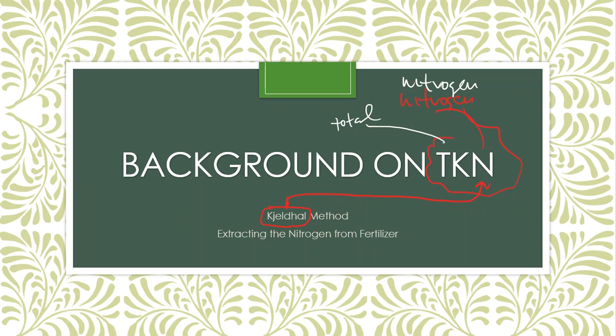It seems like a lot of things that we do in the program are pharmaceutical type based tests. And in this one, we're trying to get away from that as well. Yet again, we're getting away from the pharma environment because we need to change it up. And for this lab, we're going to go more, I would say, environmental. And we're going to focus on a fertilizer sample.